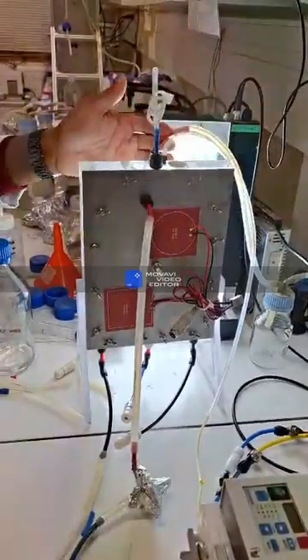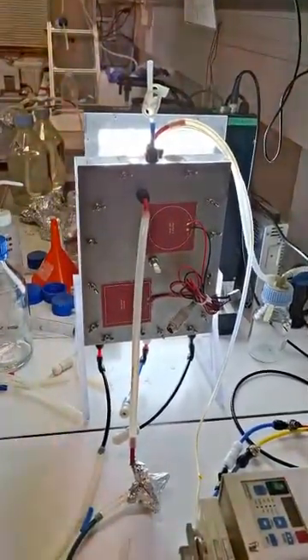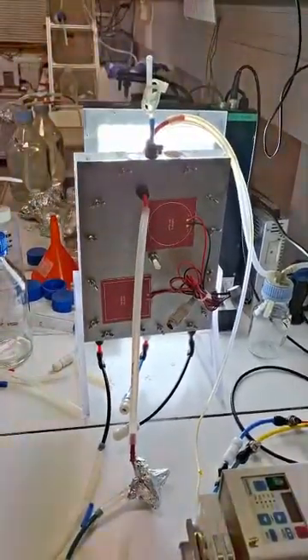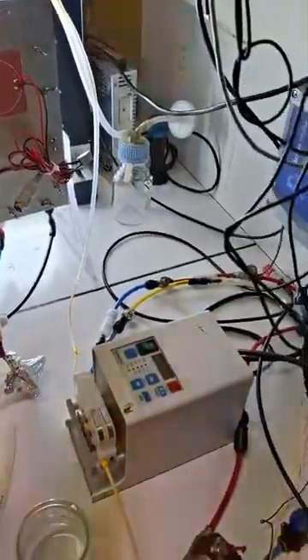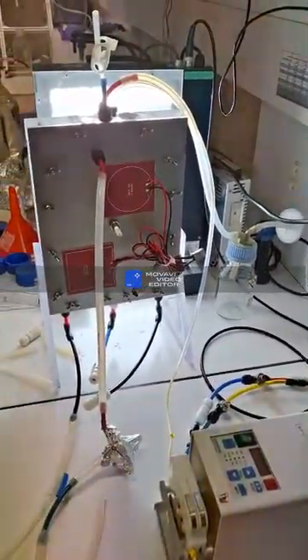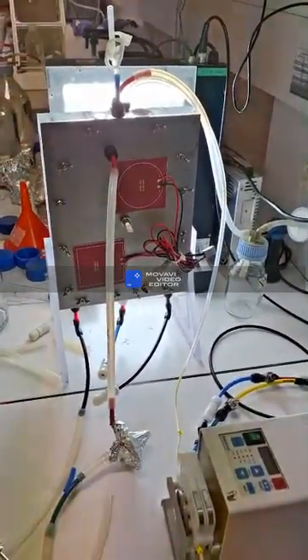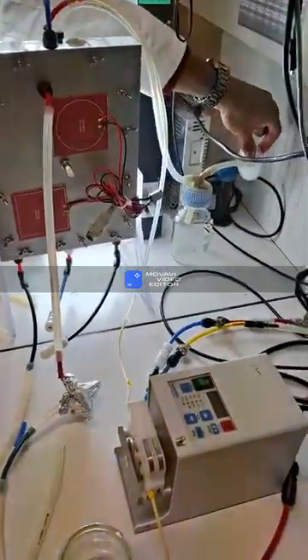So for here, you need just this pipe to remove the foaming formations, because if you have foam on the filter, which has 0.2 micrometer pores, no bacteria can pass through it, and no foam either.